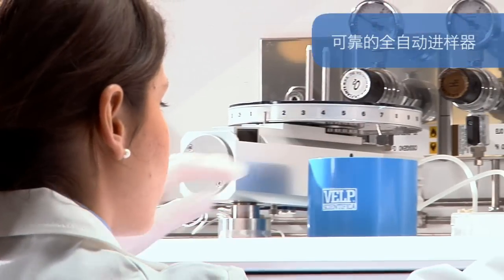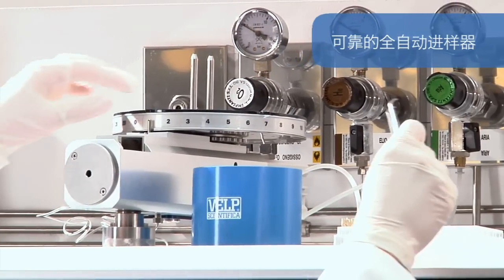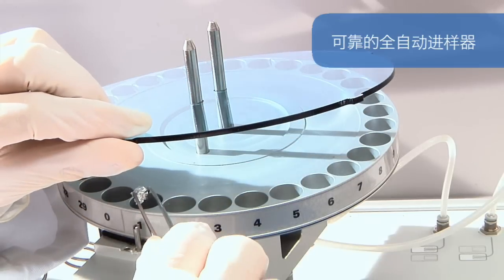The instrument includes a reliable auto-sampler that can manage up to 4 discs, each of 30 positions.